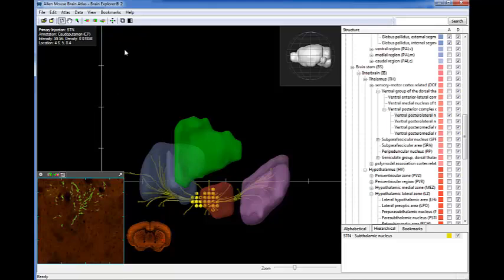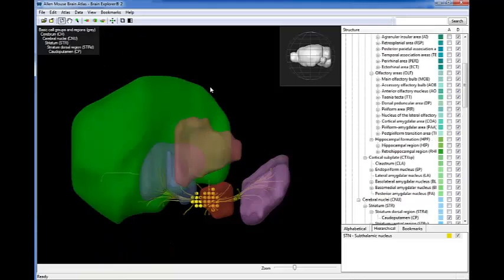You may also find projections that provoke questions, such as this one to the striatum. It turns out this is a retrogradely infected cell from the striatum.